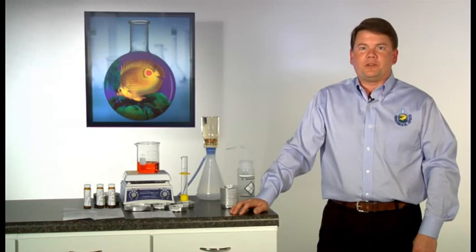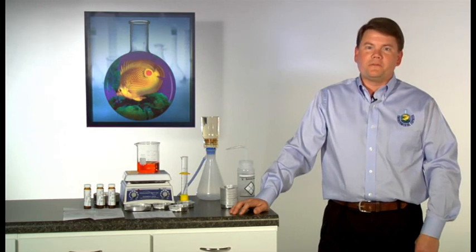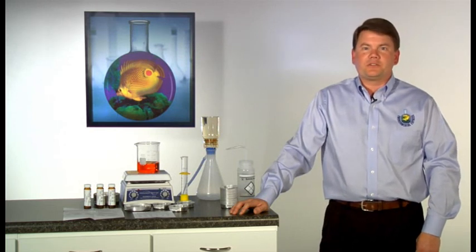Hello and welcome to Environmental Express Tech Tips. My name is Les and we'll be talking about ProWeigh filters for total and volatile suspended solids.